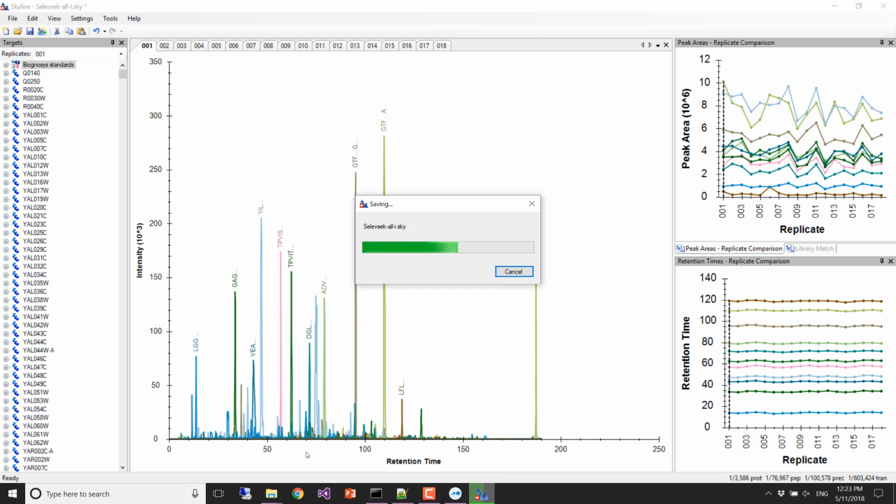It's meant to run on a laptop, but not with proteome-sized data. I can't even give you the raw data files, right? I've got a 500 gigabyte flat SSD here, which is jam packed with everything that I would want you to have, and I can't give you all a 500 gigabyte SSD. I couldn't even give you all a 64 gigabyte flash drive because that was too expensive.